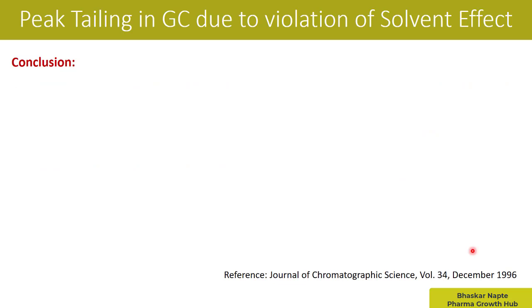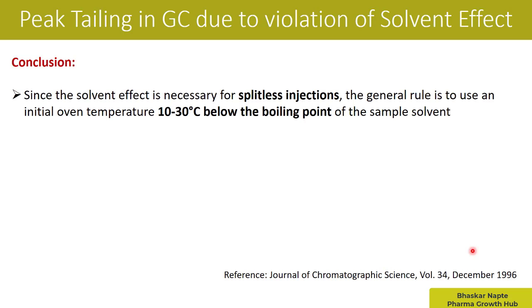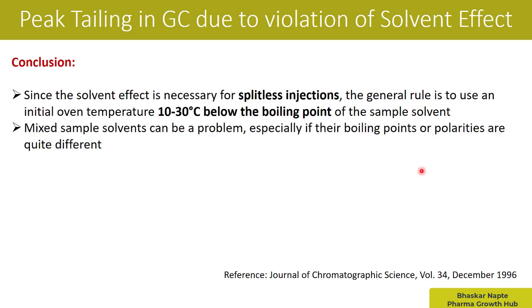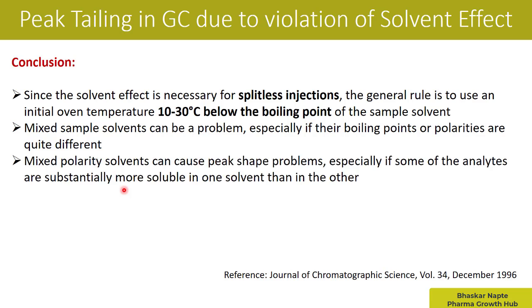Let us understand the final conclusions. Point one: since the solvent effect is necessary for splitless injections, the general rule is to use an initial oven temperature about 10 to 30 degrees Celsius below the boiling point of the sample solvent. The second important conclusion: mixed sample solvents can be a problem, especially if their boiling points or polarities are quite different — for example a mixture of water and DMA. Make sure the solvents are of similar polarities.